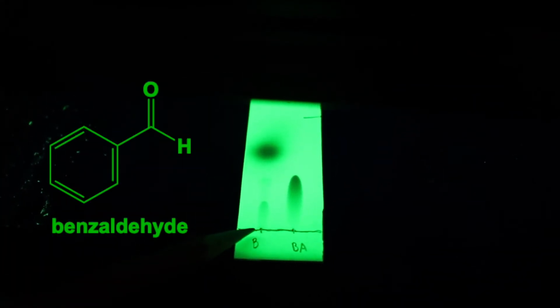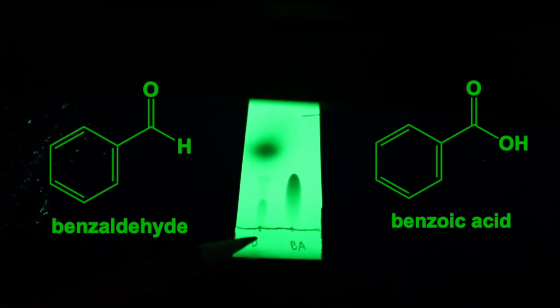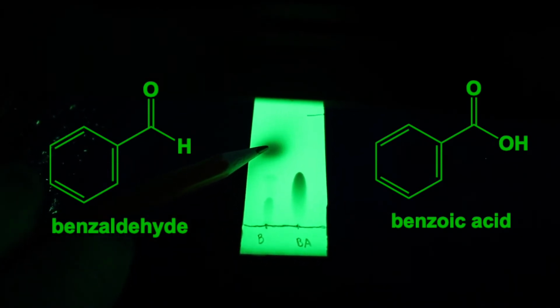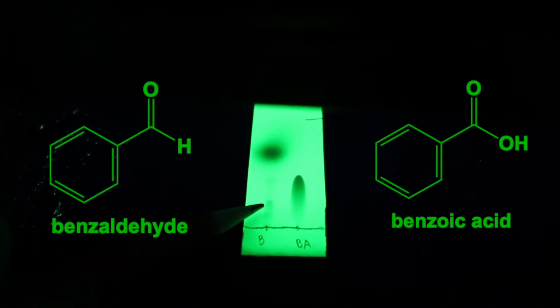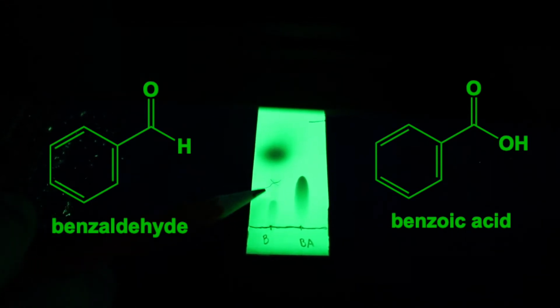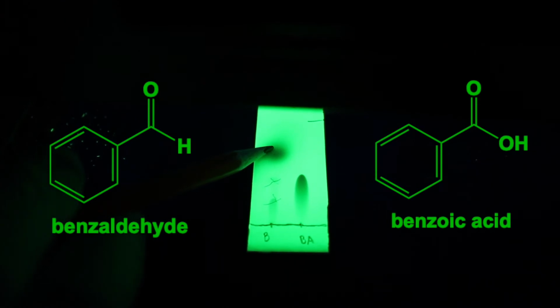So we can take our plate and we can place it underneath the UV lamp, and as you can see, there we go. So on our left lane here, we have benzaldehyde, and then on the right lane, we have benzoic acid. Now, you'll notice that the benzaldehyde lane actually has a couple spots. It has a major spot up here, it has a smaller spot here and here, and that's because this benzaldehyde is kind of old, so there are some impurities. So for our purpose, we're kind of going to neglect these spots, just imagine they weren't there. This is the benzaldehyde major spot.